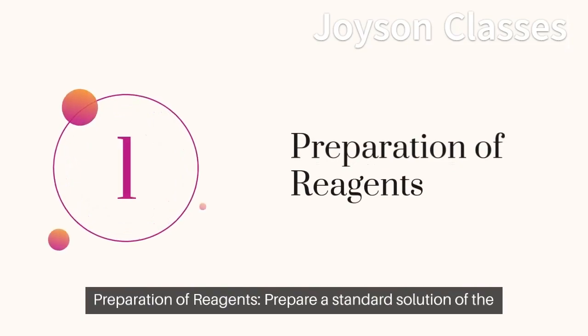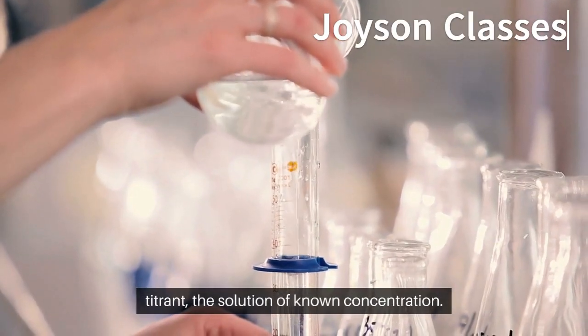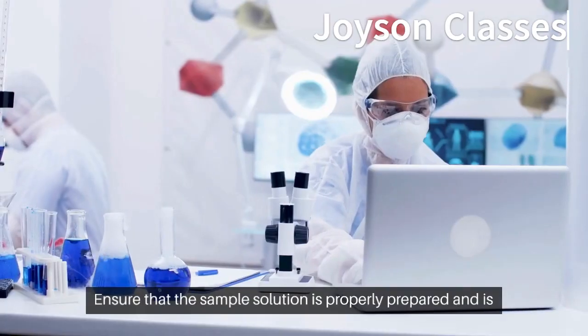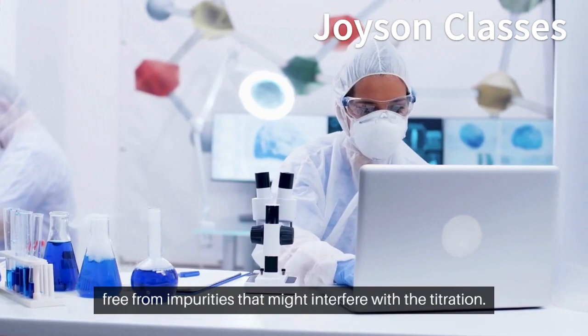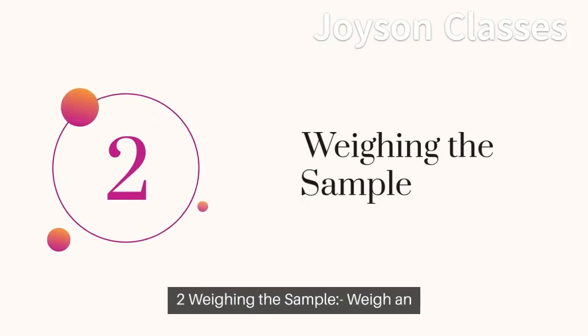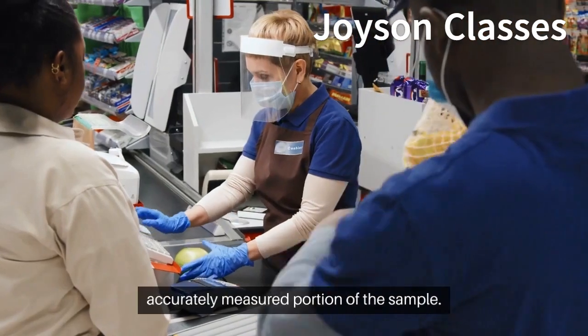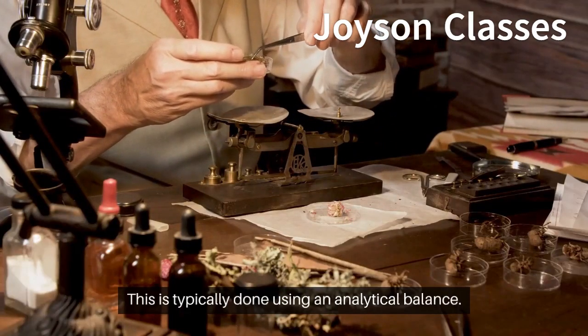1. Preparation of reagents. Prepare a standard solution of the titrant, the solution of known concentration. Ensure that the sample solution is properly prepared and is free from impurities that might interfere with the titration. 2. Weighing the sample. Weigh an accurately measured portion of the sample. This is typically done using an analytical balance.